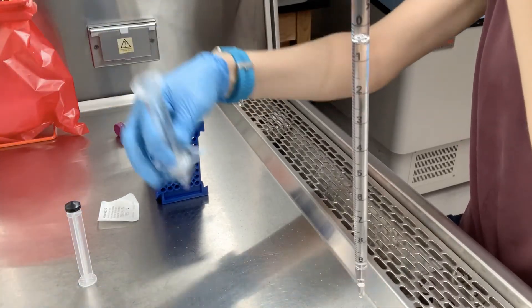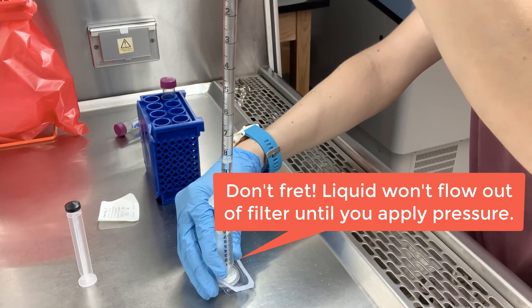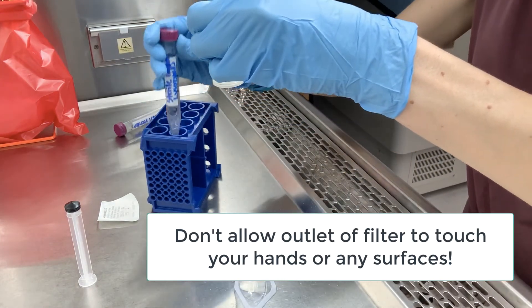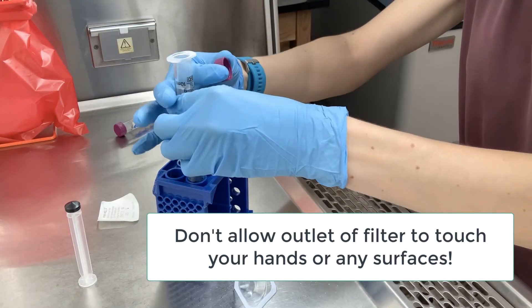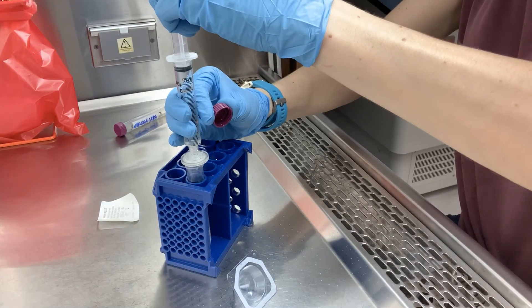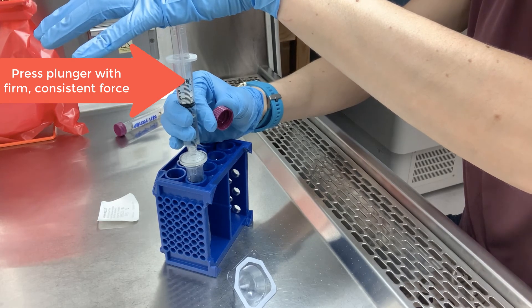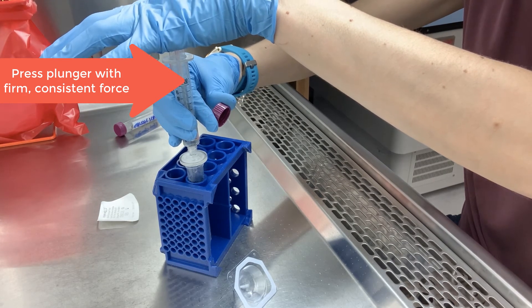I pick up my sterile filtration apparatus, being careful again not to touch the bottom end — the post-filtration end — of the filter. I dispense the liquid into the apparatus, keeping in mind that there will not be liquid running through the filter until I apply pressure. I open up the sterile container — this could be a microtube or a falcon tube such as we're using here — then place the plunger into the top and apply a steady force, not super fast, but over the course of several seconds, resulting in a fast drip dispensing into the receiving sterile container, pressing with consistent force until the plunger is all the way down and the dripping has stopped.